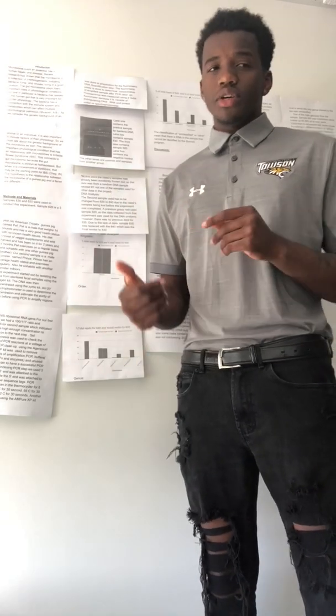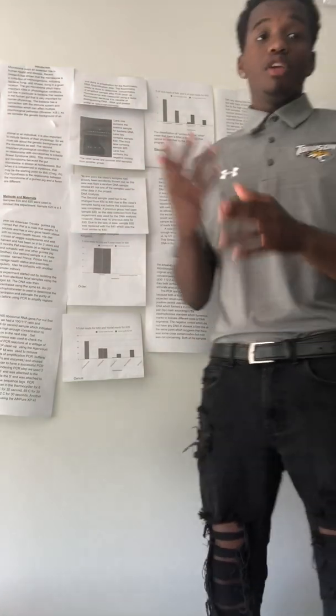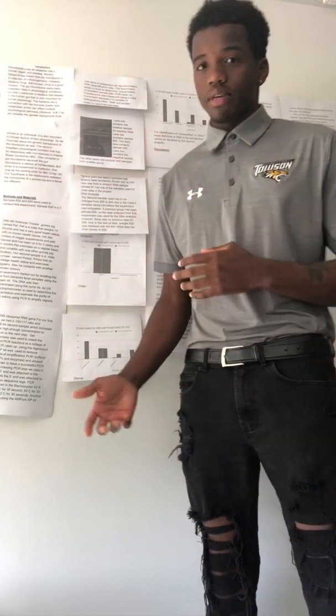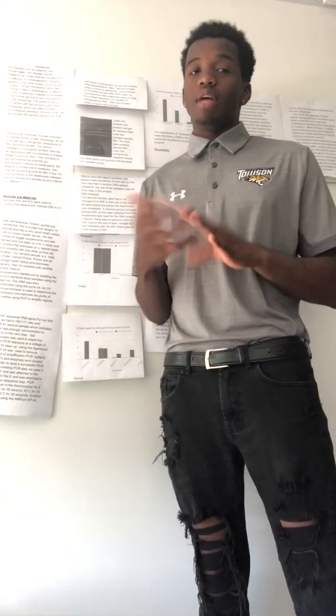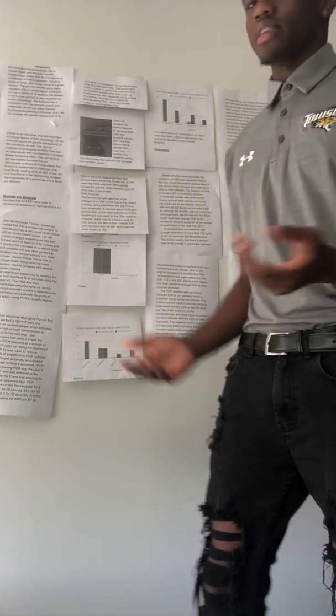Basically, this means that there is enough DNA in the sample to represent the distribution of bacteria in the gut microbiome. In our original samples before they got thrown out, unfortunately, they were higher than 100 nanograms per 50 microliters. So that means they contain enough DNA to go through accurate analysis.